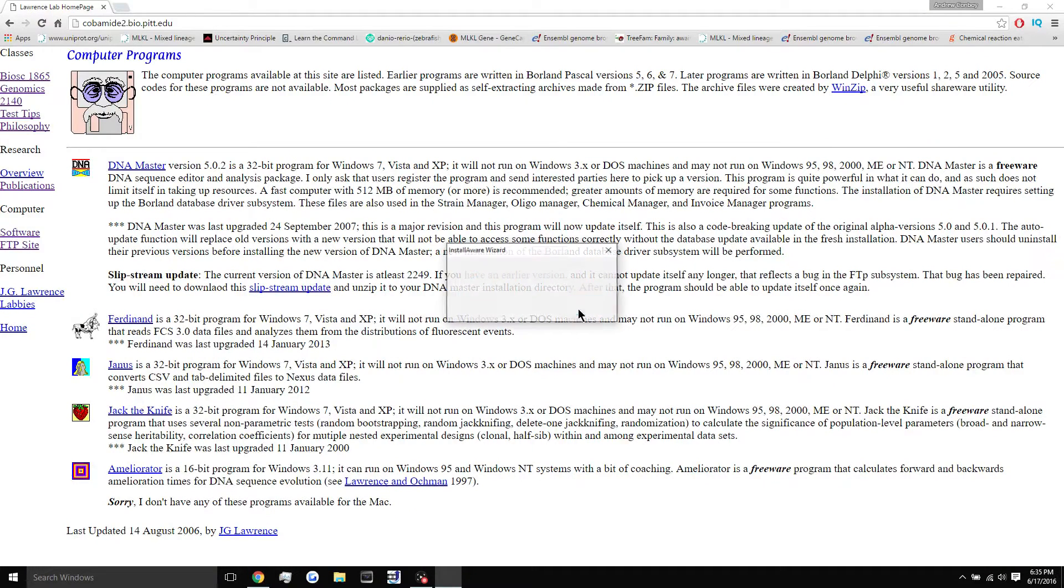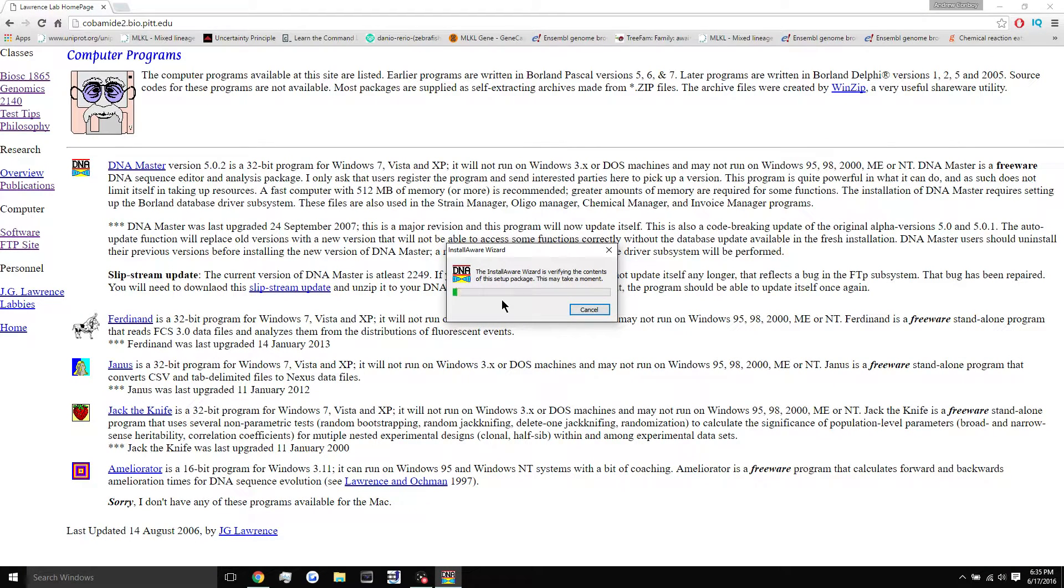Here we go. We're going to hit yes. Now this is going to pop up every time you open DNA master. It's going to ask for administrator permissions.